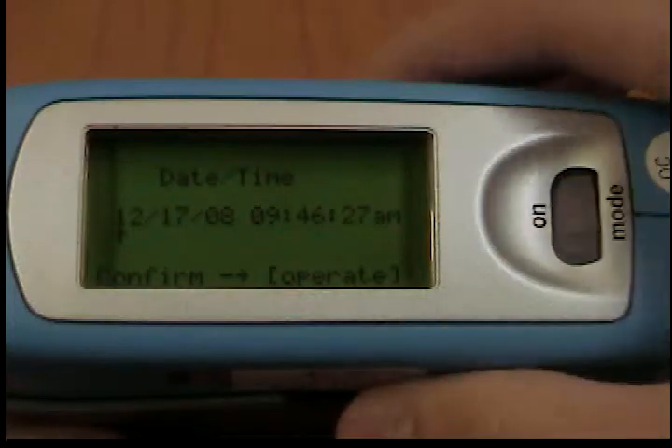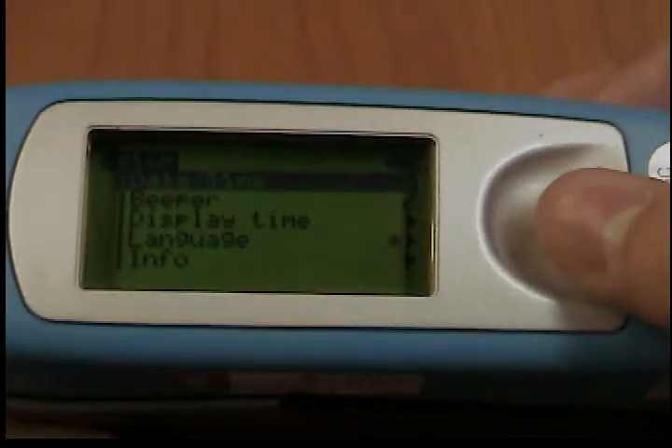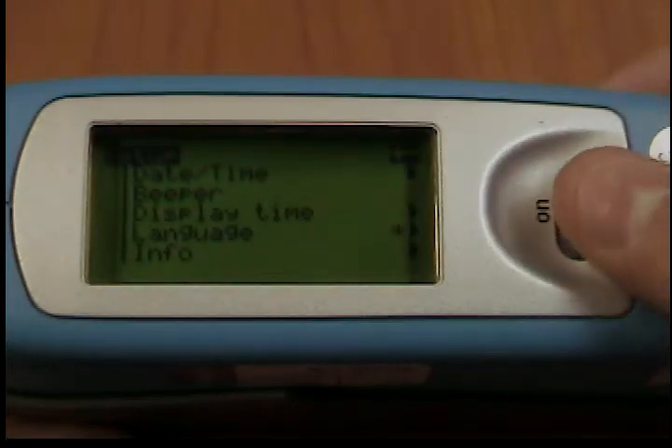Beeper. You can use this menu option to turn the beeper on or off. Use the scroll wheel to move the mark to beeper and press the wheel. When the beeper is turned on, a check mark appears at the end of the line.